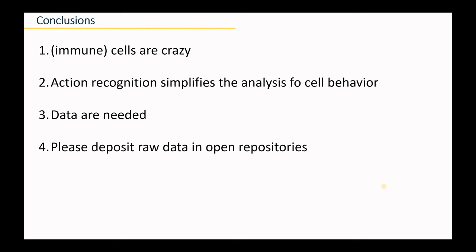Action recognition simplifies the interpretation of their behavior. To do this, we need data, so please deposit raw microscopy data in open repositories, like IMMUNEMAP.